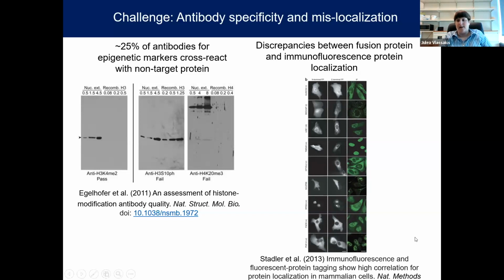And so, we could have a spirited discussion about what's correct in this case, but certainly even since this 2013 paper, there have been other papers showing artifacts like a transcription factor leaving the nucleus upon fixation. So it's in some cases a fixation artifact that mislocalizes the protein relative to where it was in the live cell state. So that's a challenge with immunofluorescence and using fixed cells and then antibodies to detect those proteins.